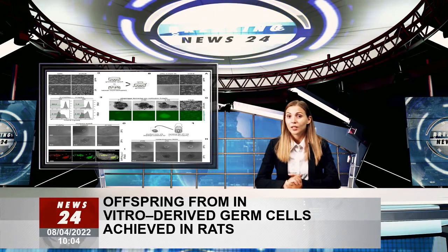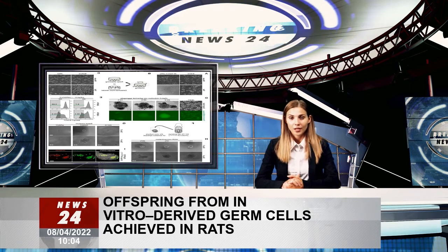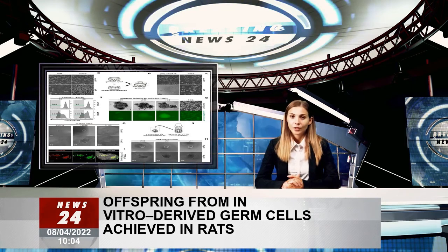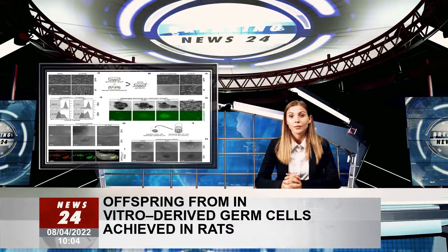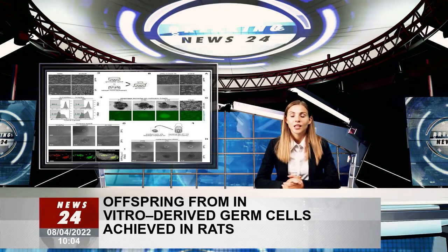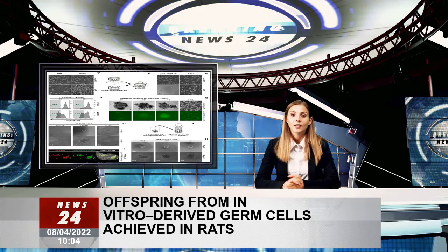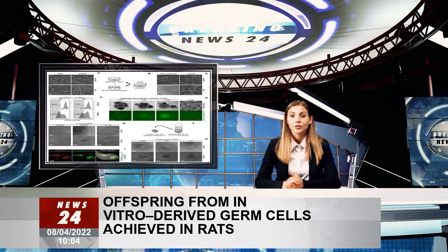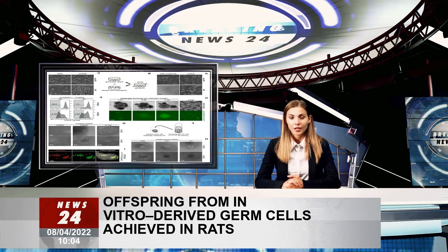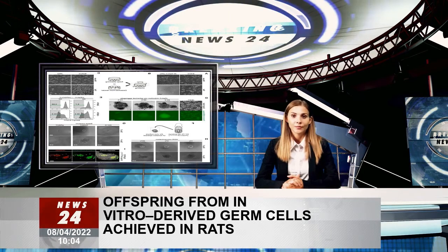PRDM14-H2B-Venus. FACS pattern of mPGCLC induction via mEpiLC in conventional 2D system and 3D system. BLIMP1-EGFP reporter was used to quantify PGCLC induction efficiency. Experimental design for optimization of culture conditions to test for viability of epiblast cells and induction of epiblast-derived rPGCs.